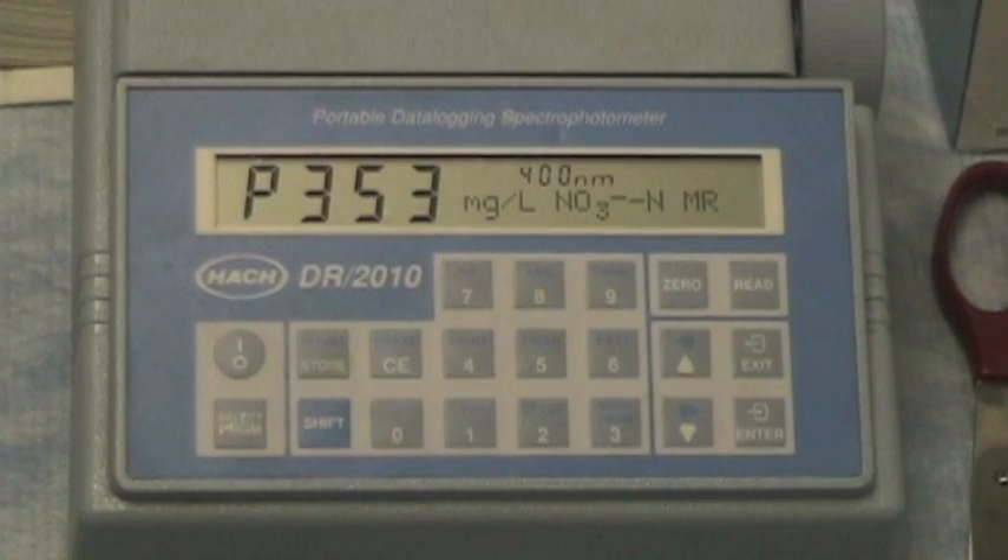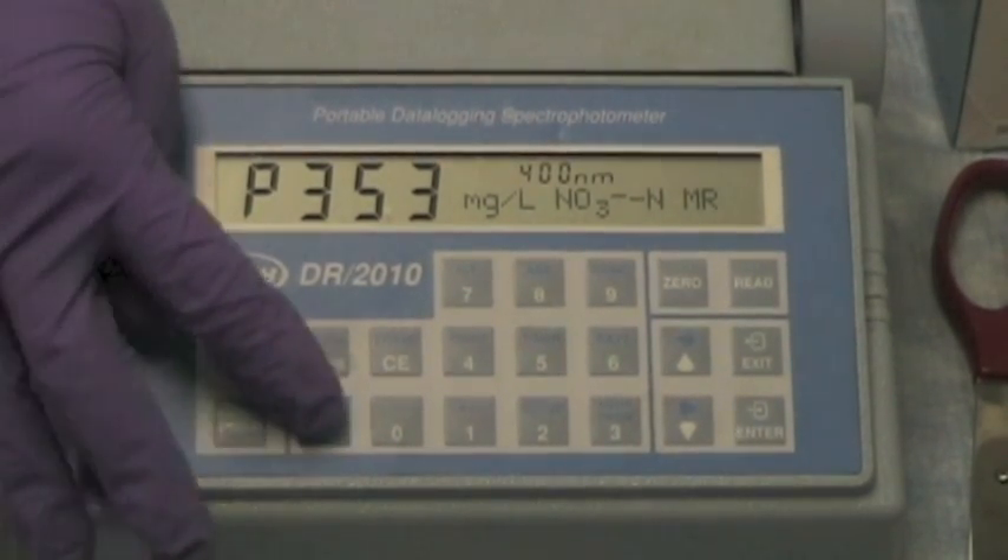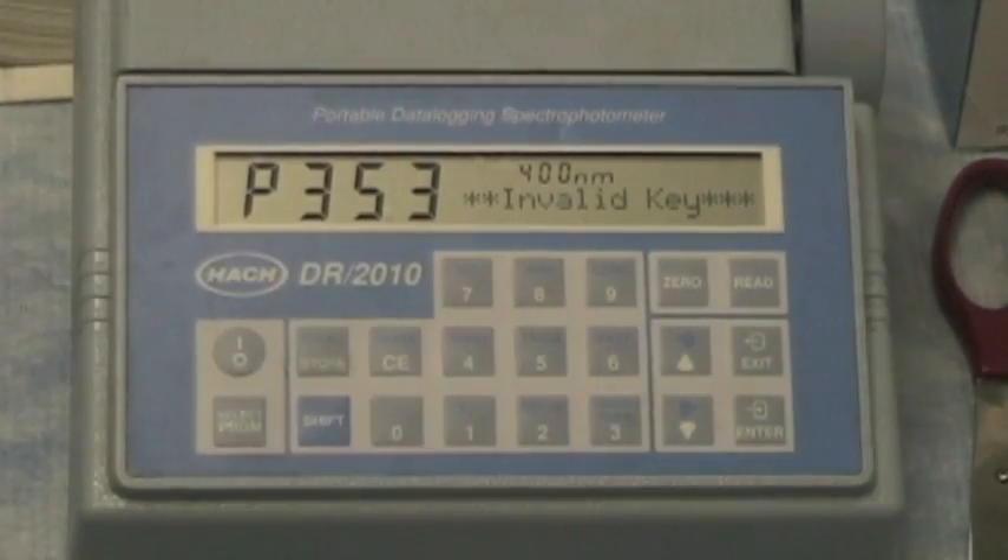After we shake for a minute, we will let it sit for 5 minutes. We will time this by pressing Shift-Timer and letting it sit.